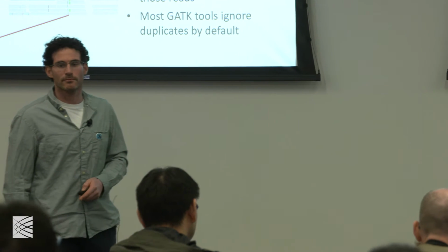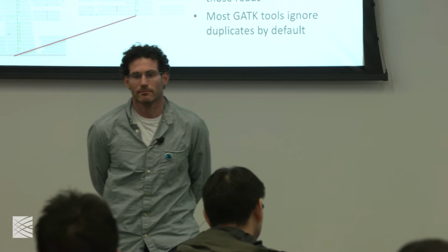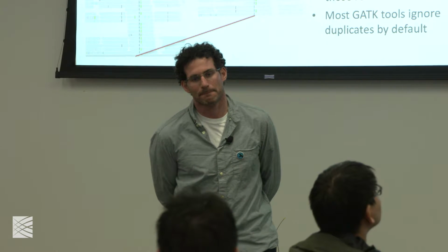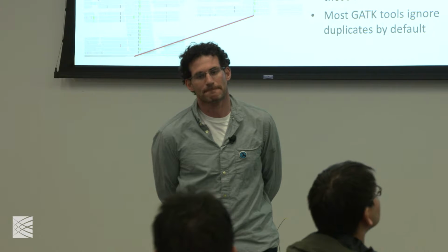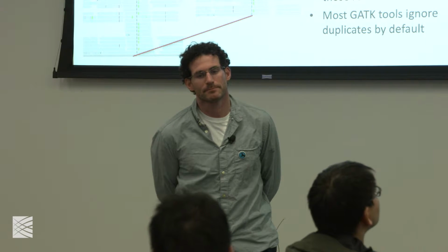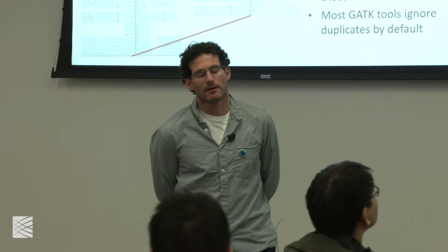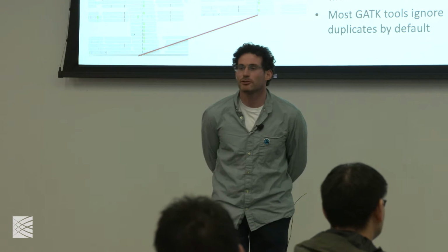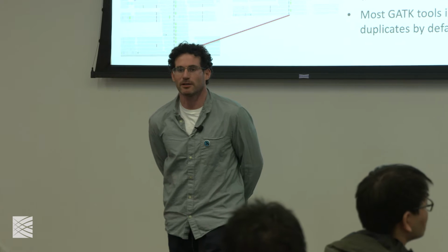I have a question about single-end reads and paired-end reads. I see some pipelines first merge the paired-end reads, then do the mapping. I don't do that. So what's your suggestion? The question is that there are some pipelines that merge the first read and the second read into a composite read.